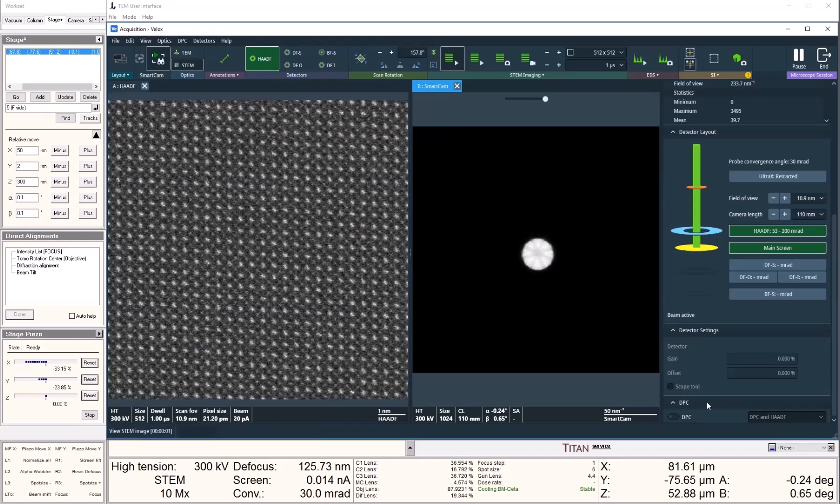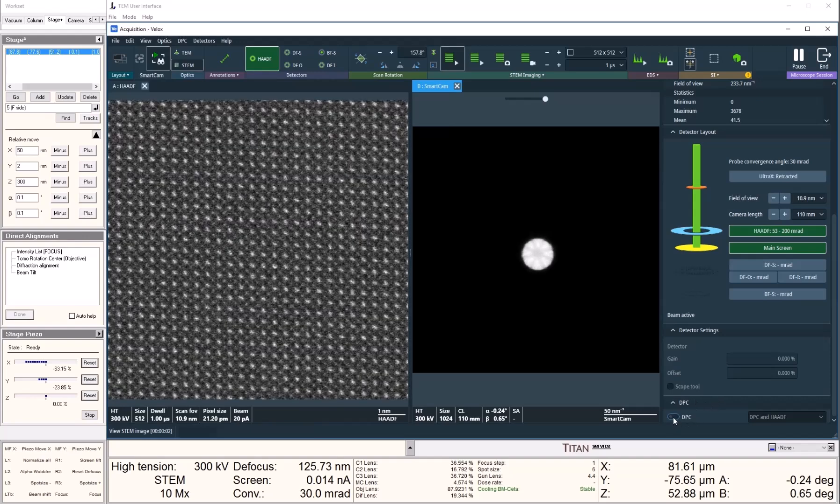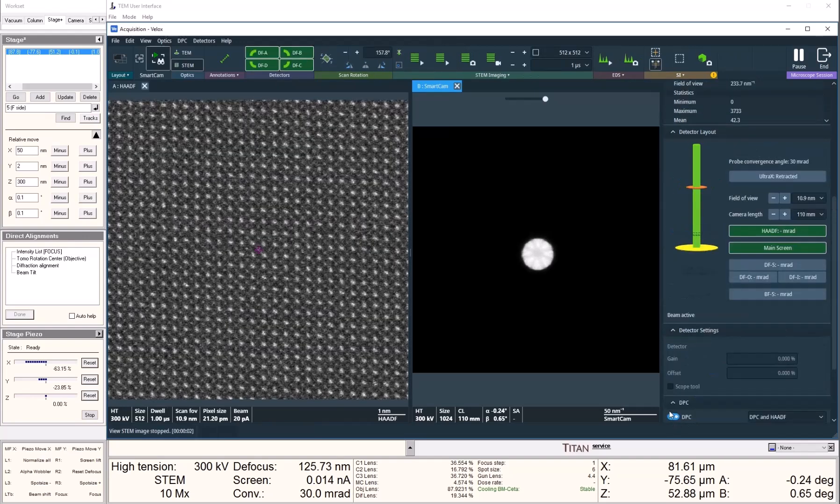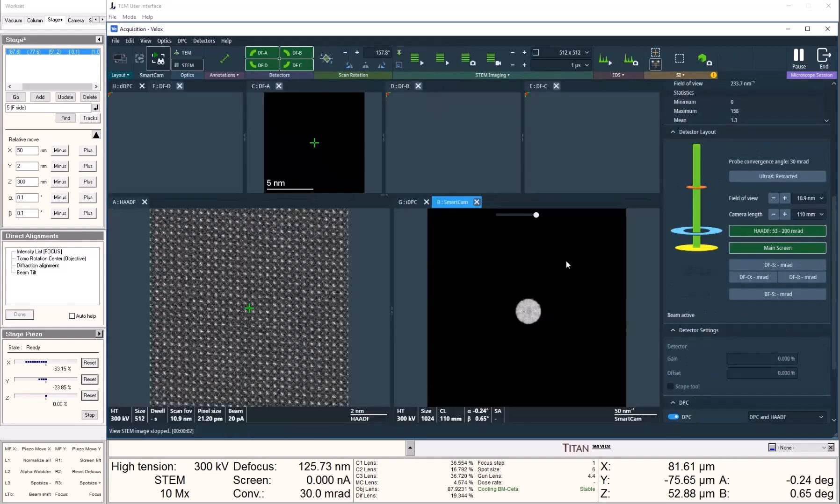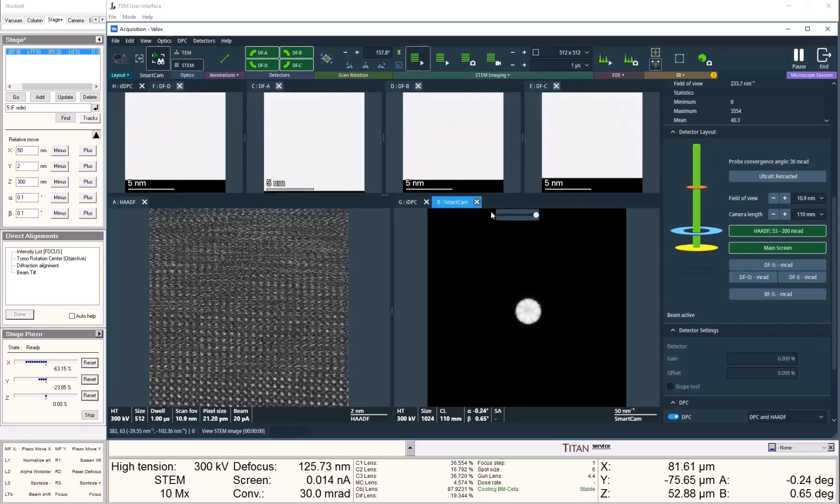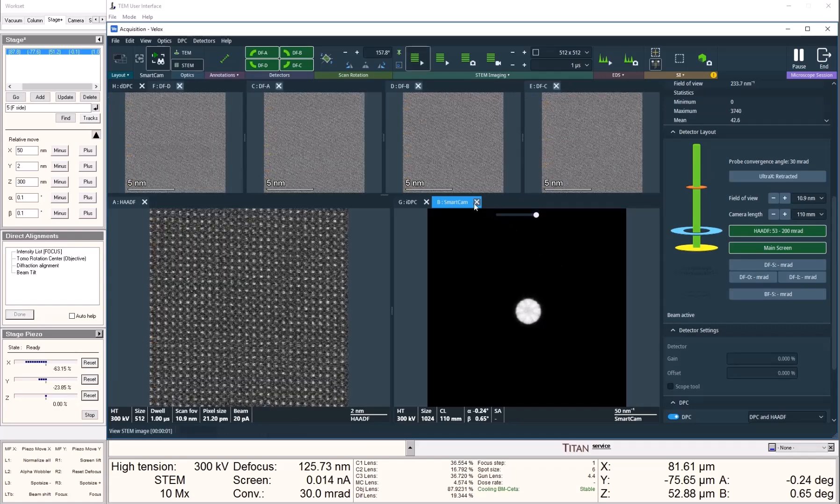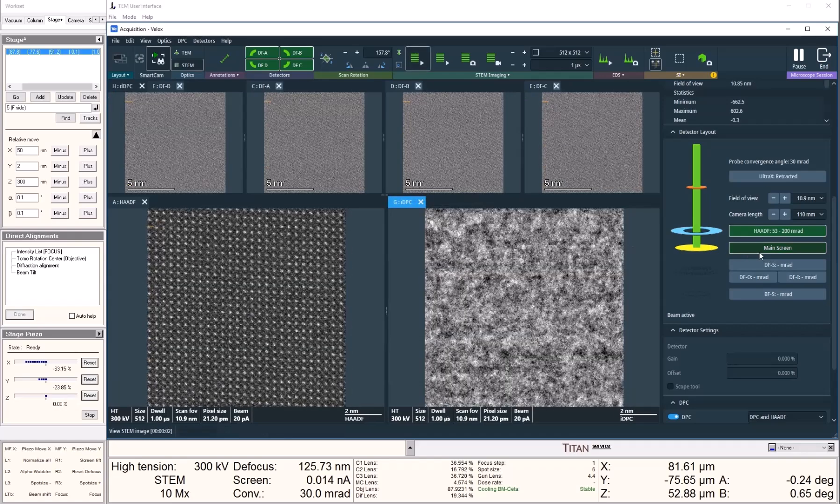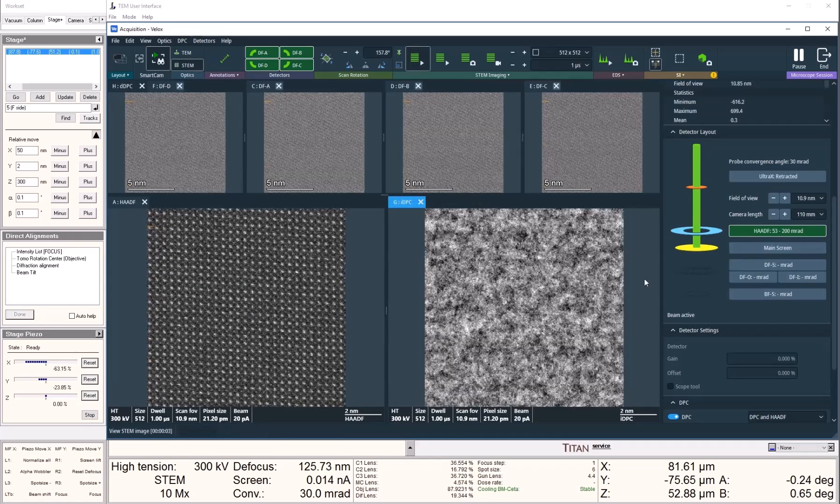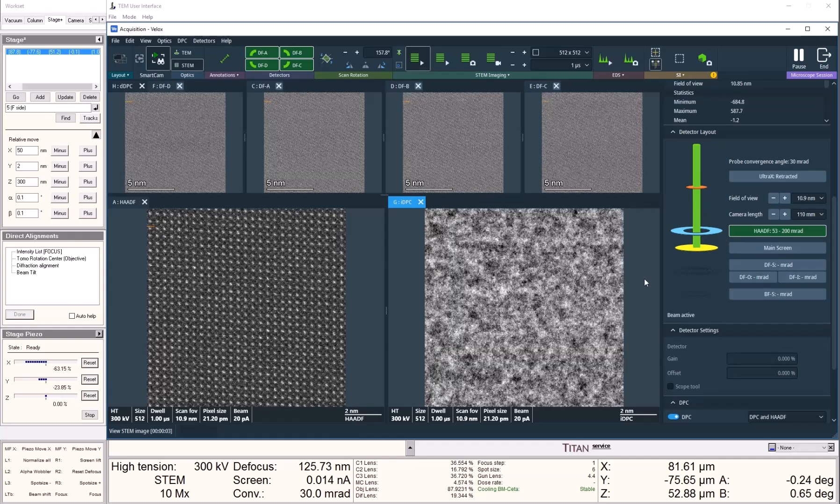To start viewing IDPC images, we simply click on the DPC button at the bottom right corner of VLOG. This will start viewing the signals from the dark field detector in its four segmented quadrants.